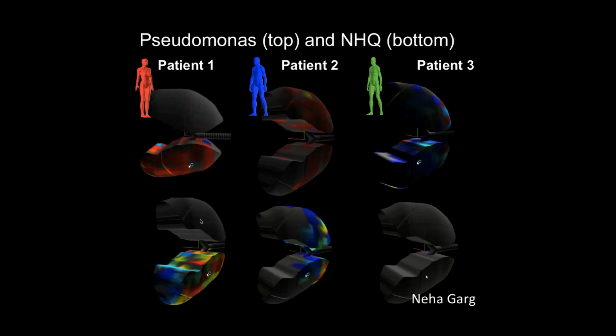But what's nice is that you can begin to incorporate many different analyses. So here we have an example of lungs that we're investigating, and we can map microbes, which are on the top, and the molecules that actually come from these particular microbes. And so you can clearly see that some of these molecules that come from these microbes are only seen in the top and not the bottom. And that shows that there's very different microenvironments that exist within these particular lungs.